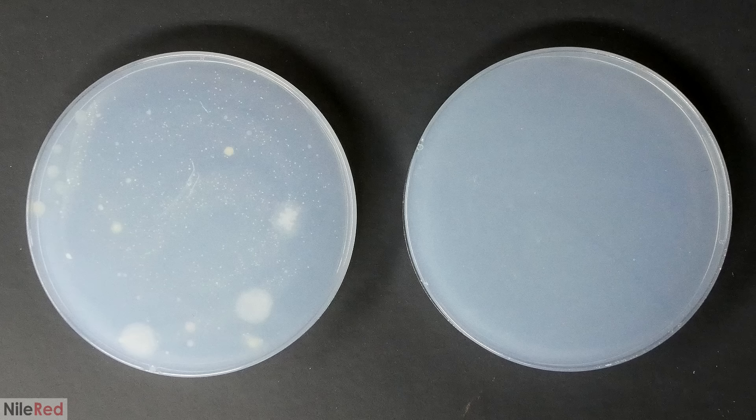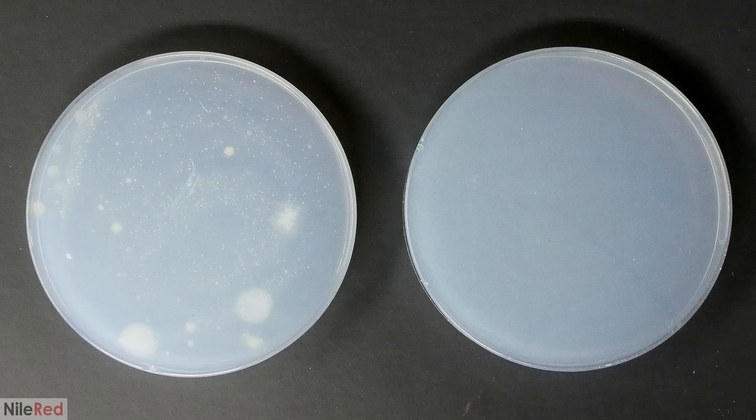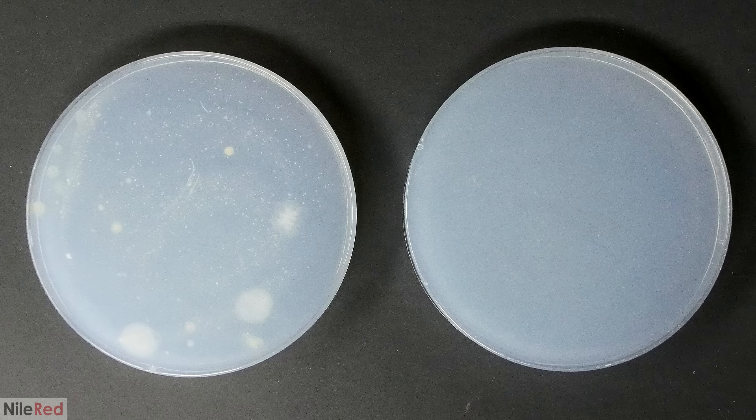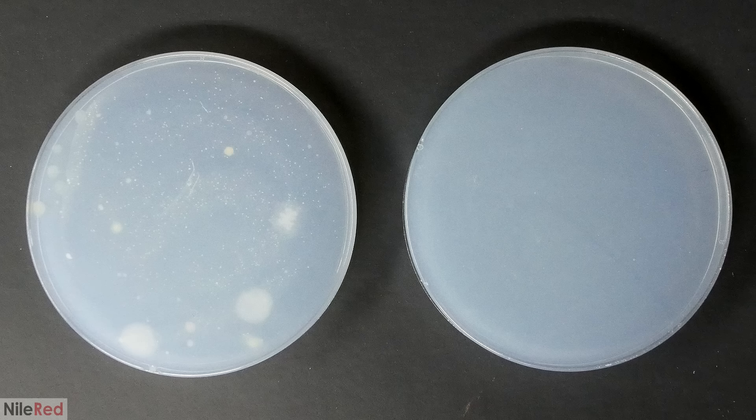One important thing to point out, and you may have noticed, is that there's no chlorobutanol left on the test plate. I mentioned before that it has a high vapor pressure, and over the course of about a week, it kind of all disappeared. I think before it all disappeared, though, it was able to completely sterilize the plate, which is why nothing was able to grow, even over the course of two weeks.